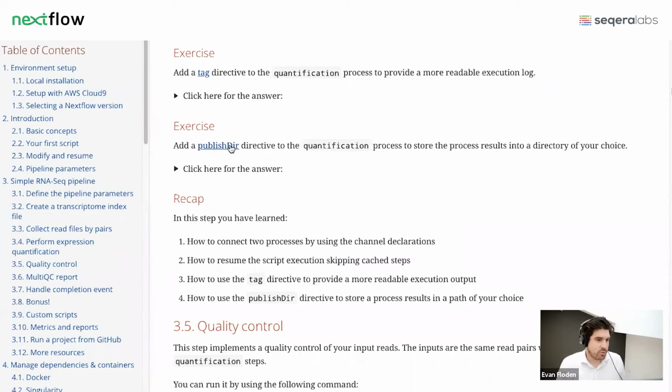It's typically things that you will do at the end of the pipeline, or results that you want to see and share with people, for example. If you click on those links there, you'll see the examples and the documentation of how they work. And then we'll start to see a little bit on how we can use them as well. Okay, let's jump in and see how we can solve that.